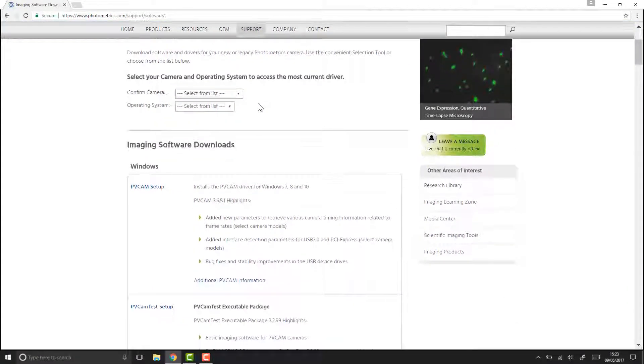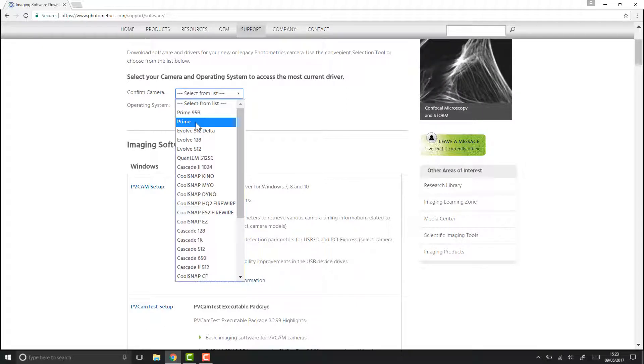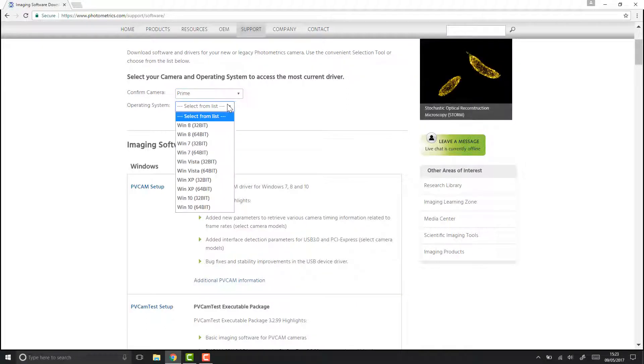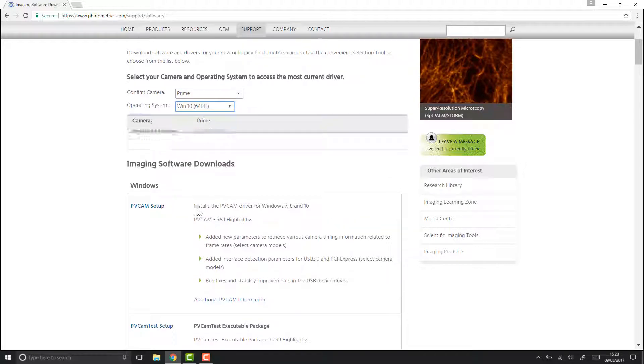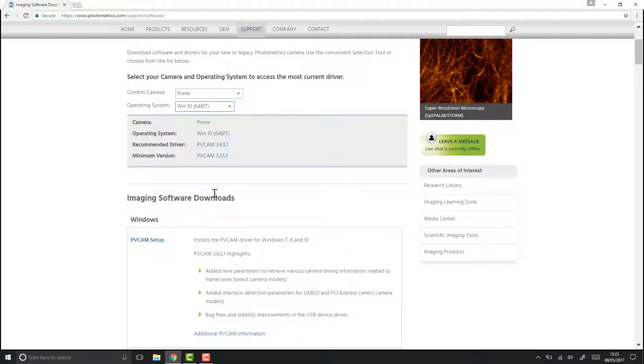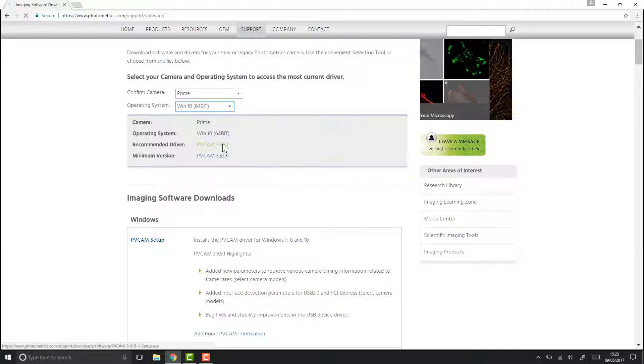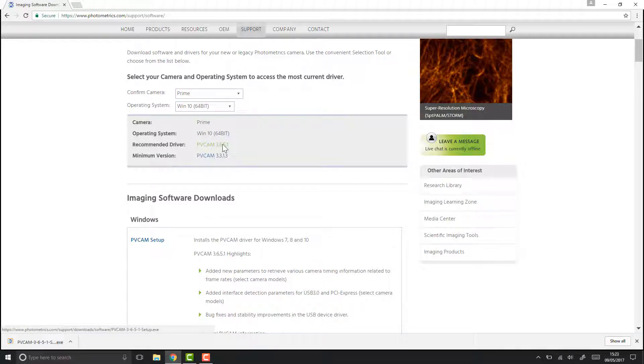First of all we confirm which camera we're using, in our case that's a Prime. Then we select our operating system, which is for us Windows 10 64-bit, and now we have a link to download PV Cam with the most up-to-date version.